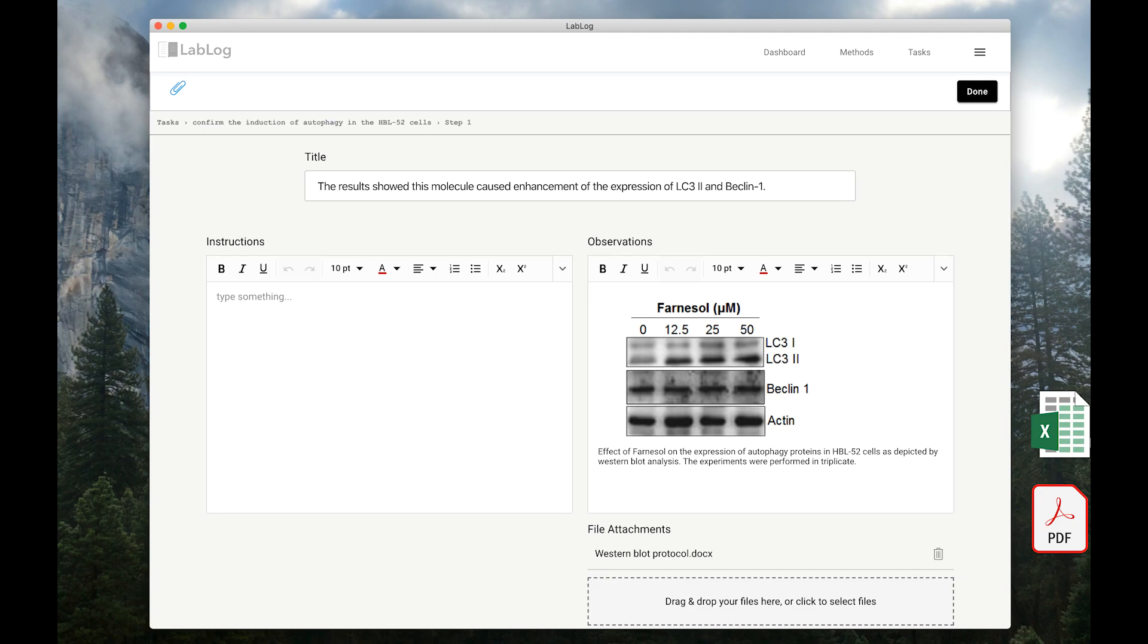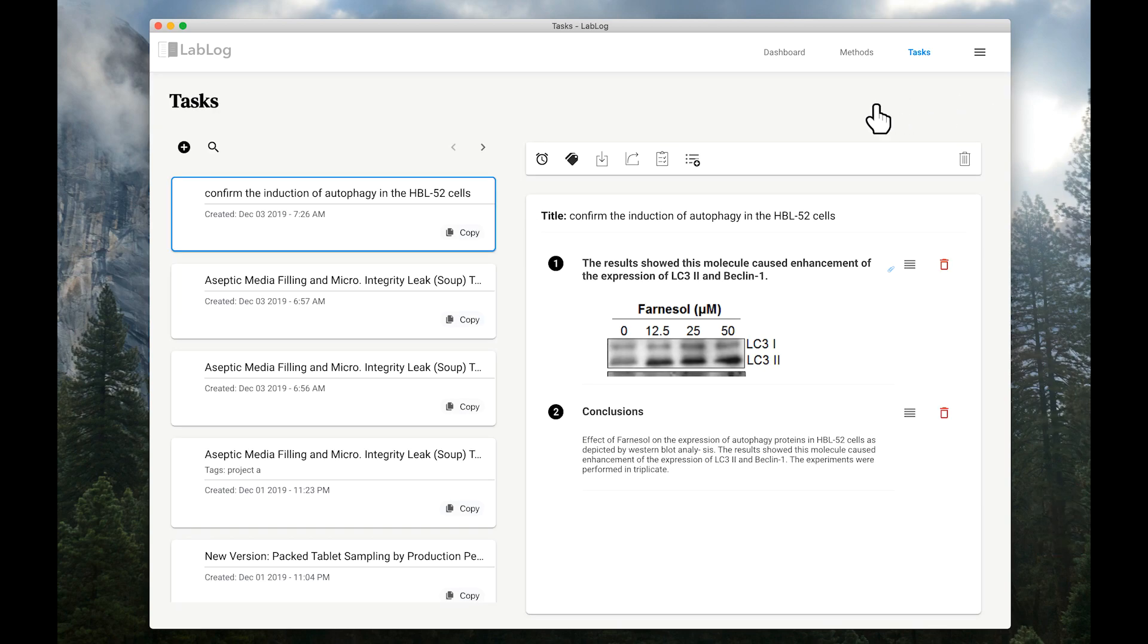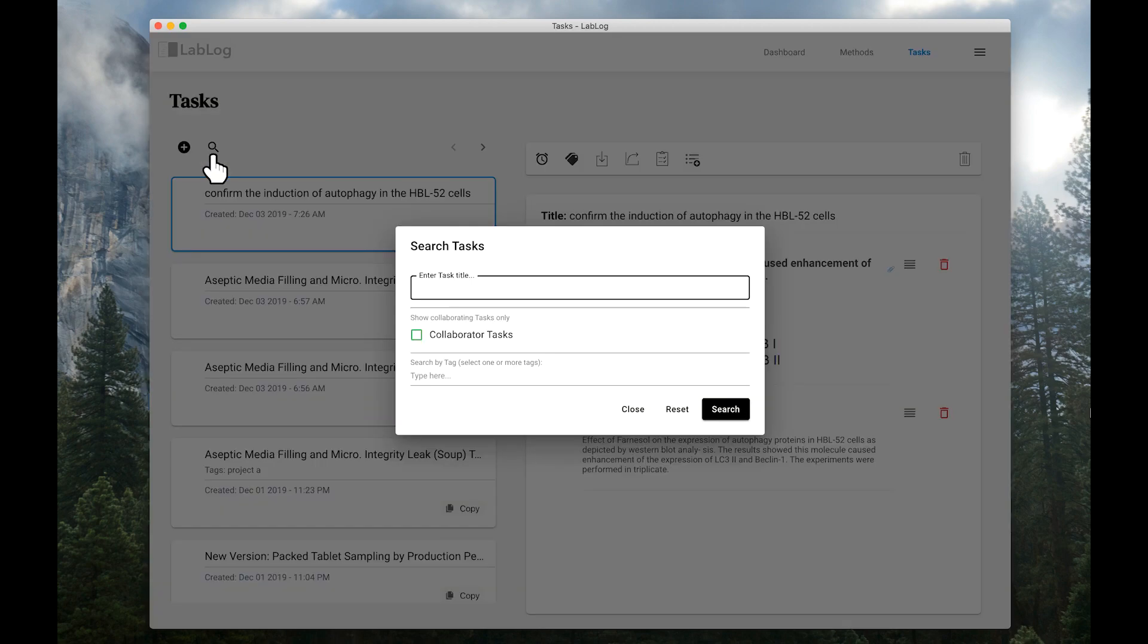LabLog makes file attachments more transparent, contextual, and efficient. Everything you add to LabLog is searchable. Notes, scheduled events, files, even the content within those files.